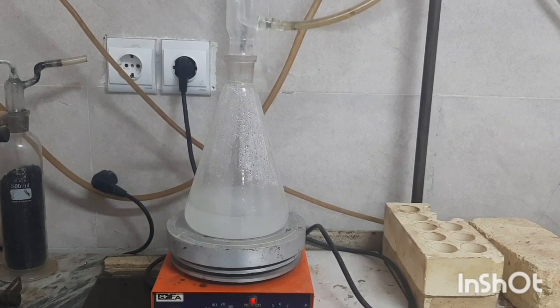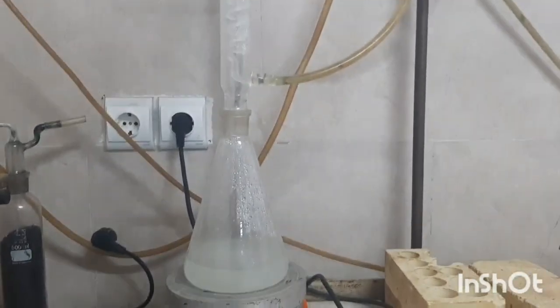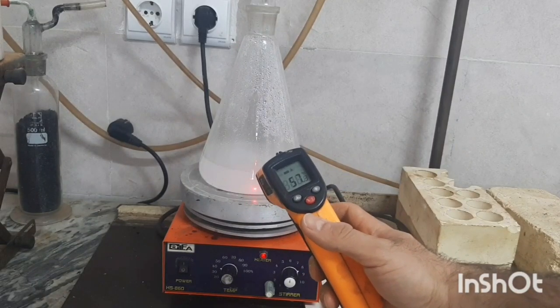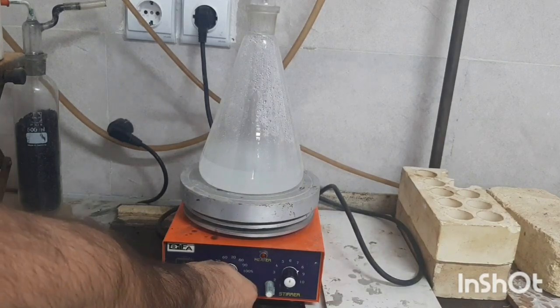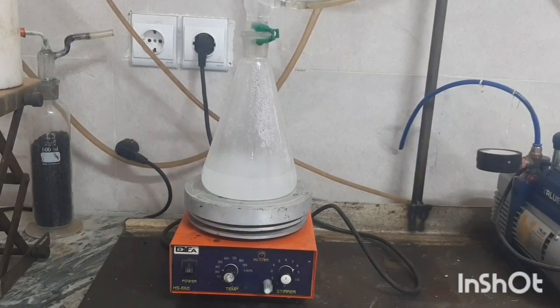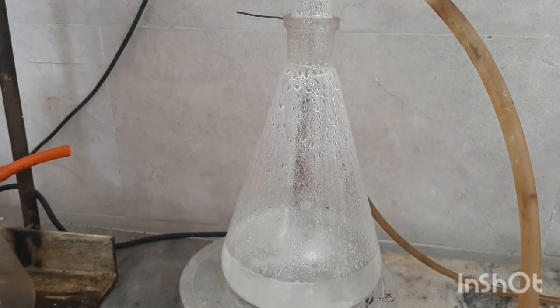So I have set up the mixture for heating and I'm gonna wait for it to boil. The mixture started boiling at around 90 degrees Celsius and rose up to 95 and stayed constant for the rest of the reaction. I let it reflux for 24 hours and came back the next day for the workup.